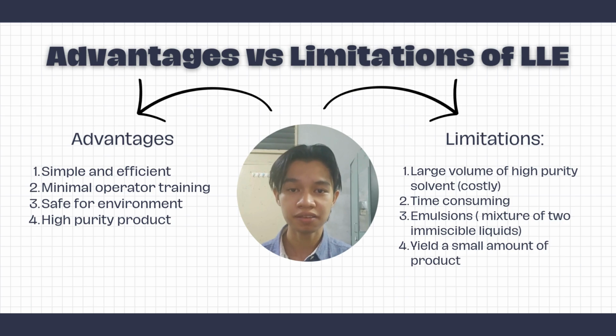Proceed to the advantages and limitations of LLE. Let's start with the advantages. It is simple and efficient, making it a go-to process in many industries. It requires minimal operator training, meaning anyone can use it with ease. It is considered safe for the environment. LLE does not require energy-intensive heating, unlike distillation, with reduced carbon emission. And lastly, it yields a high-purity product.